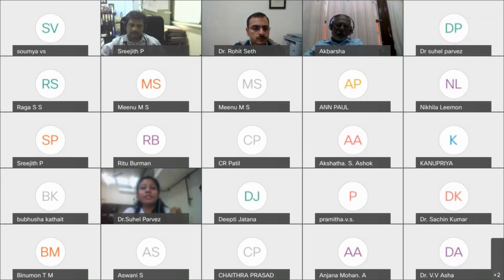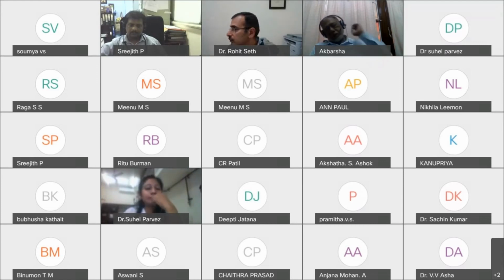Hello. Yes, ma'am. You can also soak up the media with a tissue paper, a fine tissue napkin, and you just place it at the bottom of the vial, and the fly generally sucks the media from there. And generally, we transfer the fly after 24 hours of the media preparation. So the food is perfectly solidified, and the moisture can be removed by the tissue paper. Okay. Ma'am, I'm using a lean protein model.